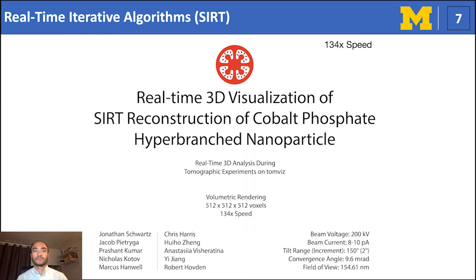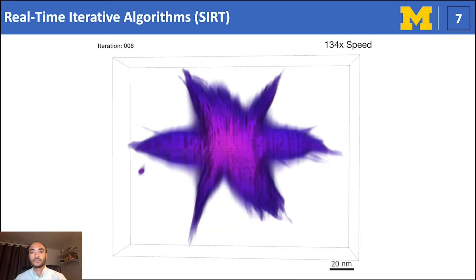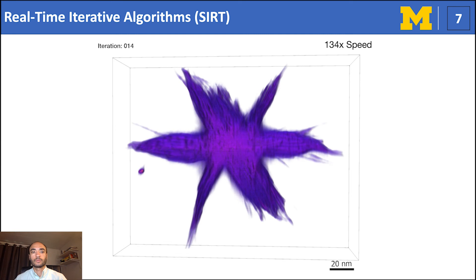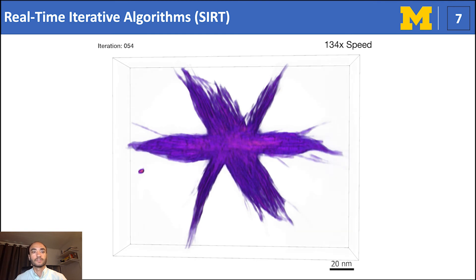TomViz contains real-time functionality for any iterative algorithm, including SIRT. Here is a SIRT demonstration for a 512-cubed cobalt phosphate hyperbranched nanoparticle reconstructed for 100 iterations. We see the reconstruction begins with a loose estimate consisting mostly of low-frequency information. As the computation exceeds beyond 50%, finer structure becomes visible. As we pass 80%, we cannot visually see any differences per iterate, and we can safely assume we're close to converged.